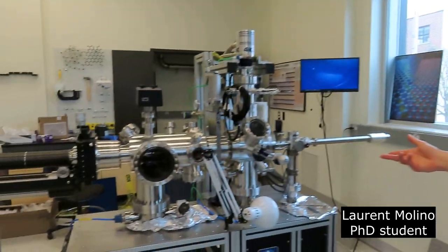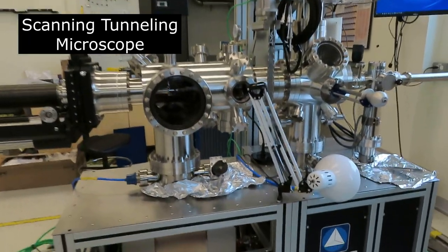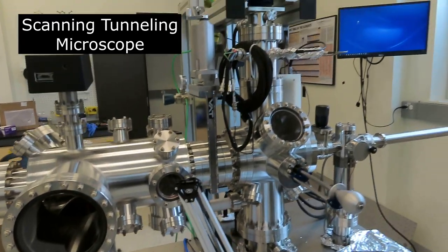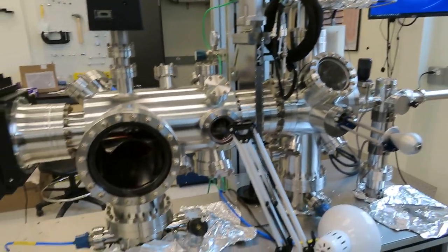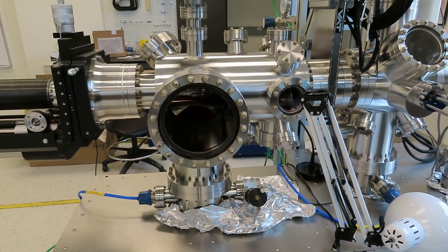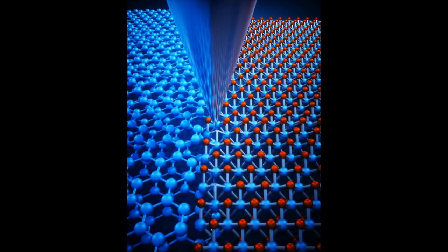Hi, I'm Laurent. I'm a PhD student at the University of Ottawa, and this is our scanning tunneling microscope. This is in the group of Professor Adina Lukin-Mayer. The principle of a scanning tunneling microscope is you have an atomically sharp tip, so the tip at the very point is just a few atoms, very sharp.